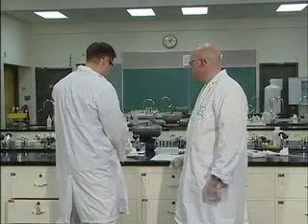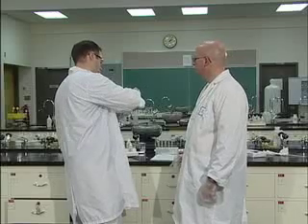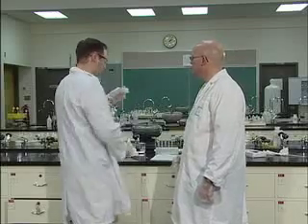Right on. So this is a flocculant precipitate that's formed in here, and you can see it right in the middle as a white jelly-like substance. And what we're going to do again is make that observation. We get a white jelly-like precipitate formed, and then we have to measure our final temperature again.